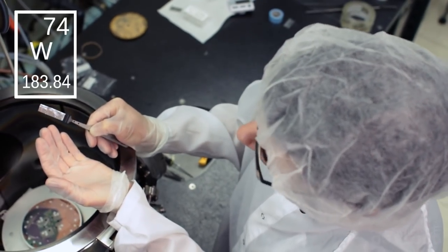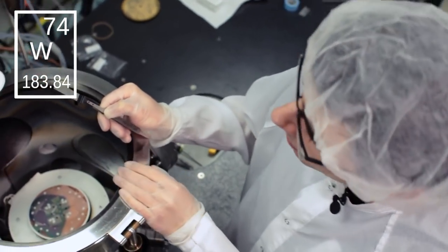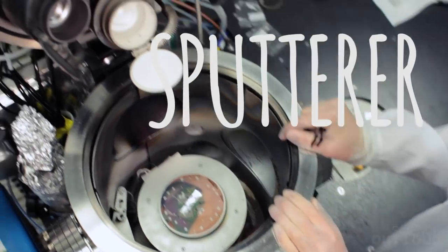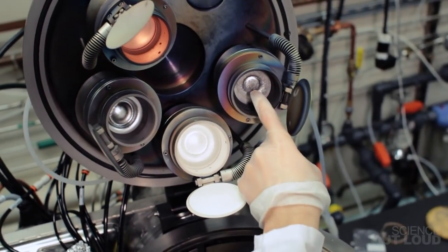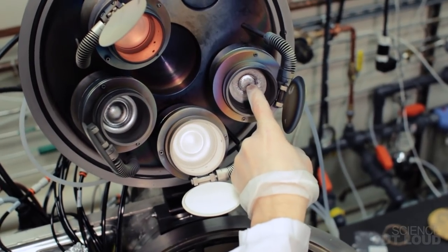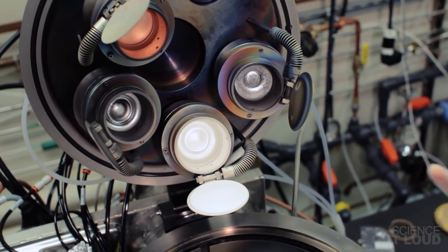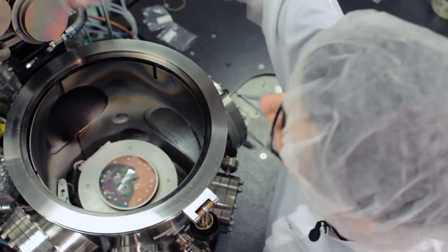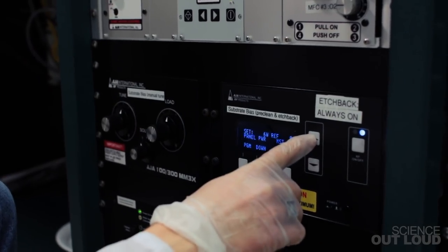This piece of tungsten foil is going to act like our soil. I'm going to place it into the bottom of this machine, which is called a sputter. The sputter applies a massive voltage to this piece of iron, and when this happens, atoms are literally ripped from the surface of the iron and deposited onto our tungsten foil, planting the seeds for our carbon nanotubes.